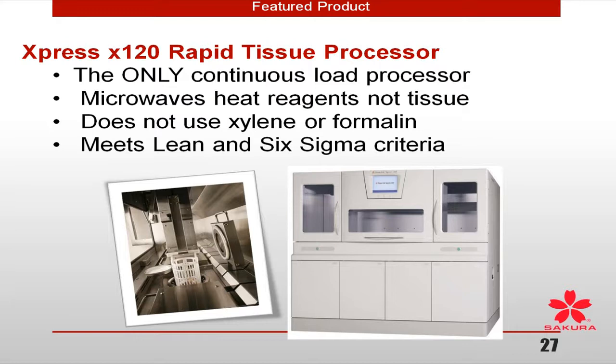Lisa, can I back something up here? I think I maybe misunderstood that last question. If you're going to use the Express and you're using an FDA product for your staining, the Express does not have xylene. So after all those other things about your workflow, you must do a validation study. You can use any FDA product not according to what it was approved for by the FDA, if you do the appropriate validation study and prove that you have correlation.